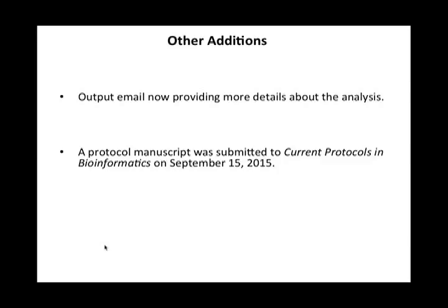Similarly, IP2, the Integrated Proteomics Pipeline from Integrated Proteomics Applications, is on the verge of launching a PSEA-Quant module. It's virtually completed right now. That allows all the mass spectrometry-based proteomics data sets that have been analyzed in IP2 to also be analyzed with PSEA-Quant.